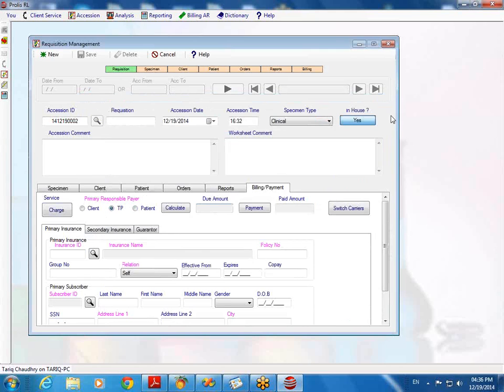In terms of what I mentioned, though, the pre-accessioning and then indicating that it's received at a later time, is that something that's possible? It is possible, but we don't recommend it. We support it, but we don't recommend it.